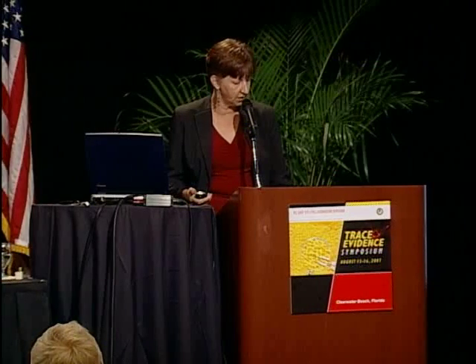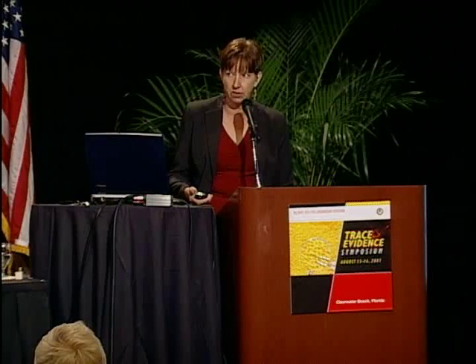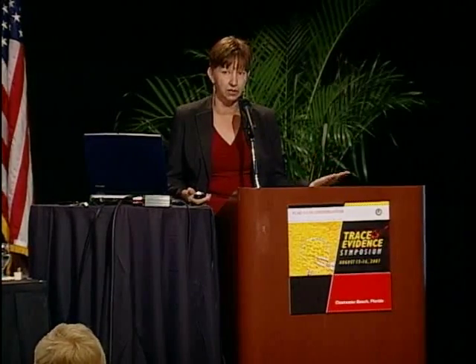And furthermore, looking at his jacket, on the right sleeve, there were some cuts that looked like cuts I had observed in burglary cases involving breakage of glass. These cuts didn't look typical of knife cuts to me. They were to the surface yarns, not to the underlying yarns in the weave.